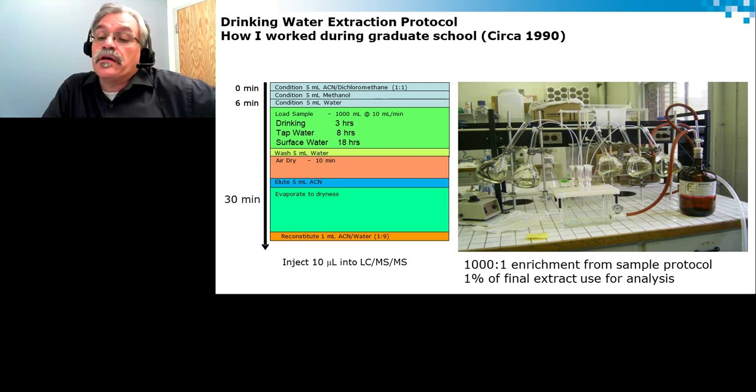It changed sample prep radically, but the concept remains the same. A lot of the time we need an enrichment process and a lot of steps to clean the sample and have a good quality extract that gives satisfactory results.